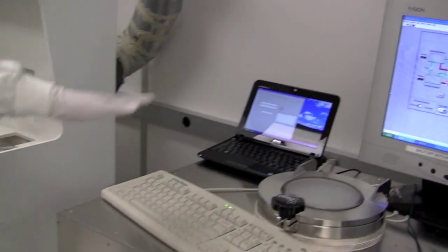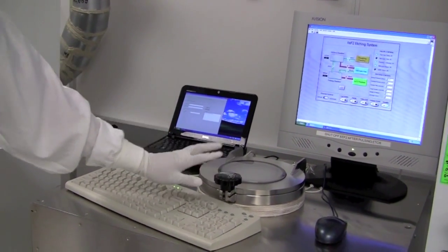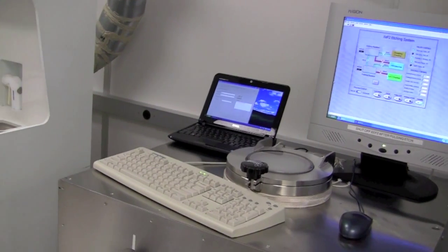Next, you want to look at the whole machine and just make sure it looks safe. This thing should be screwed on, the chamber should be closed.